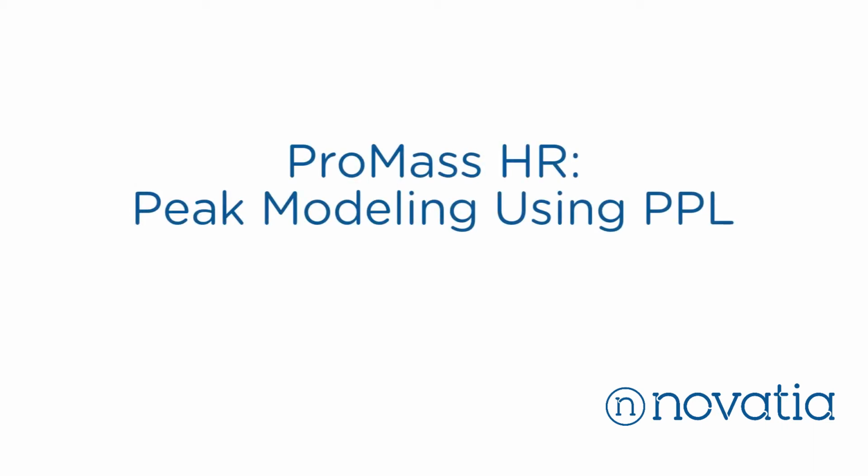Hi everyone. In this video, Mark is going to show you how to use the peak modeling features in ProMass HR. These are used to sharpen the peaks and improve resolution. In the second part of the video, Mark is going to show you an example of peak modeling using a myoglobin spectrum. He'll also discuss why you might want to create multiple models depending on your data.